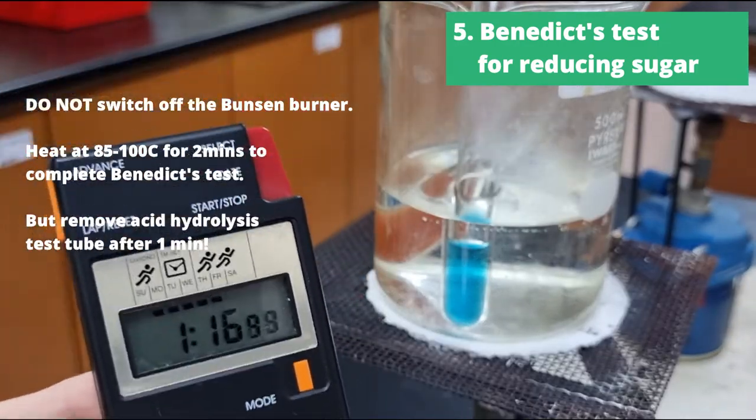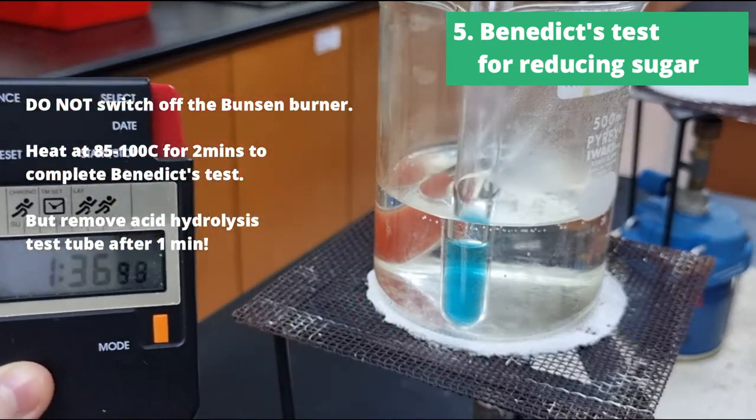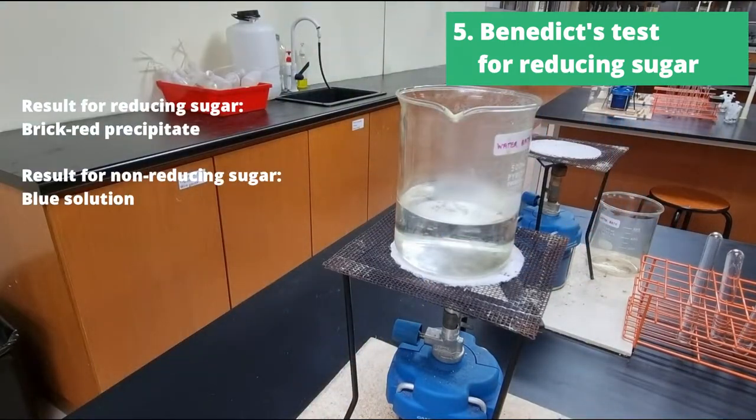You can notice the color change already in the reducing sugar test tube, from blue to brick red, whereas the non-reducing sugar has remained a blue solution.